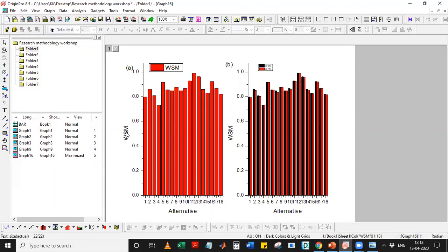If this is the reference, I want this to be arranged as per this. So I will first select this, hold shift on my keyboard, select this, and use this option, because I want both of them to be oriented to the left. Now you see they're in one perfect line. Similarly, I can repeat the process here also.